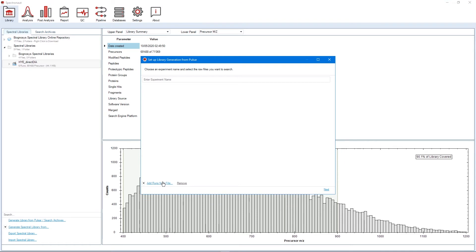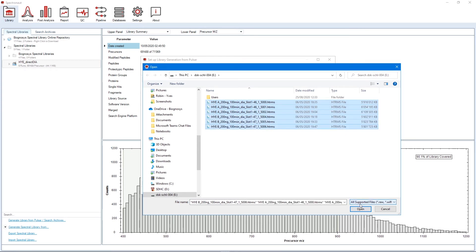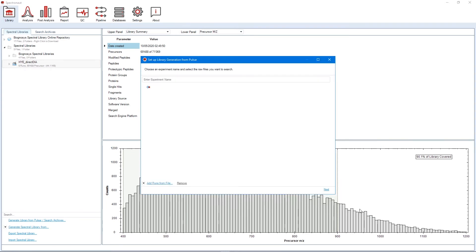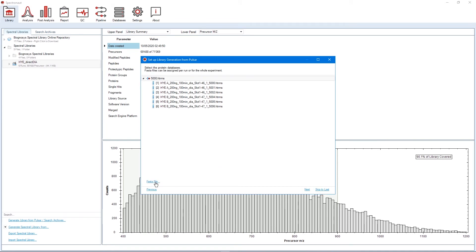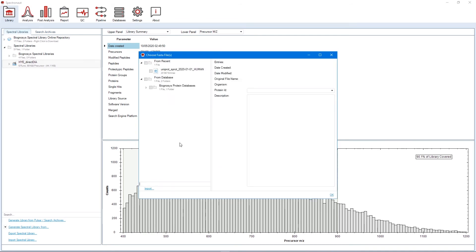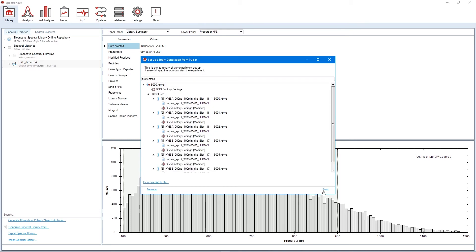Spectronaut Search Engine Pulsar can search both DIA raw files as well as HTRMS converted runs. Once the DIA runs are selected, you can proceed as usual through the wizard, which will guide you through search and library generation. There are no special requirements for the user to define when generating a DIA library.